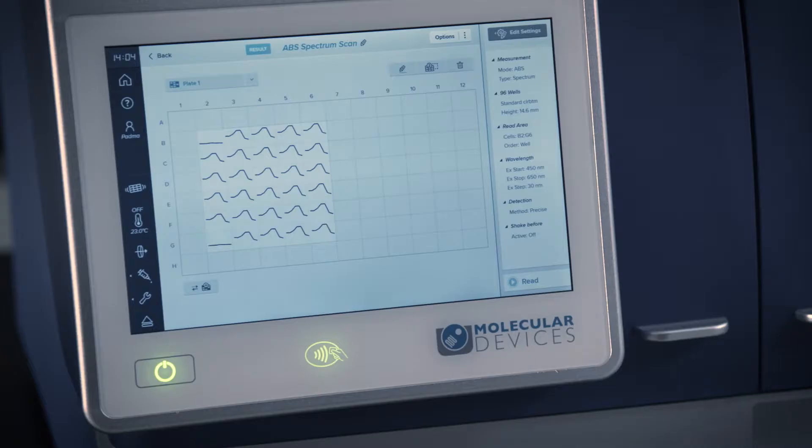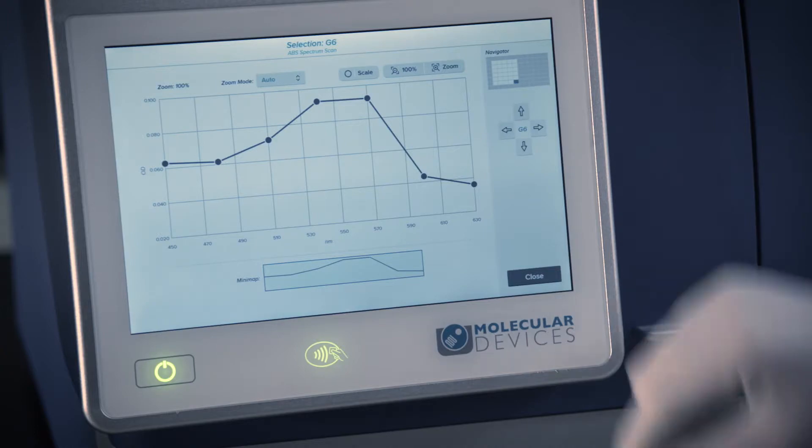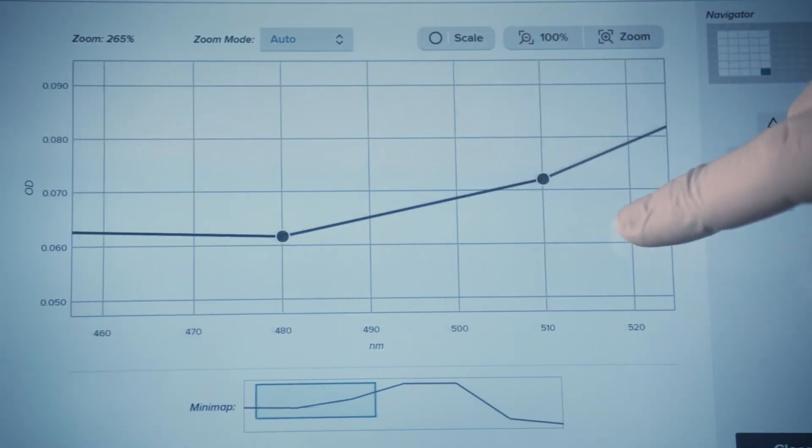When viewing kinetic or spectrum scan data, the output is a graph. Touch a single well to view the well's graph. Pinch the screen to zoom in or zoom out, and swipe left or right as needed.